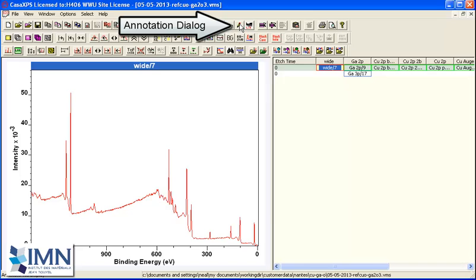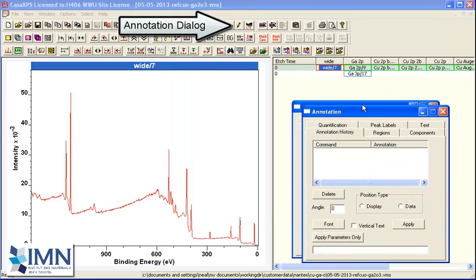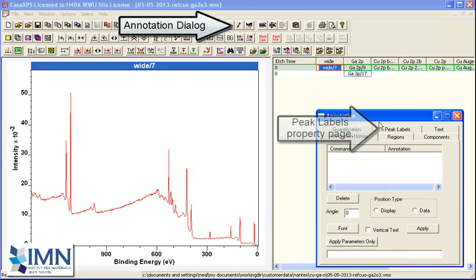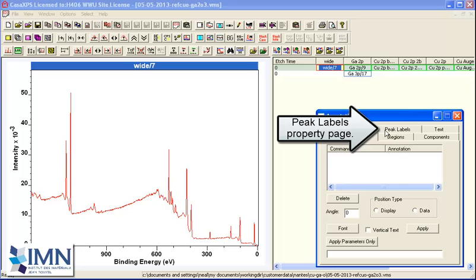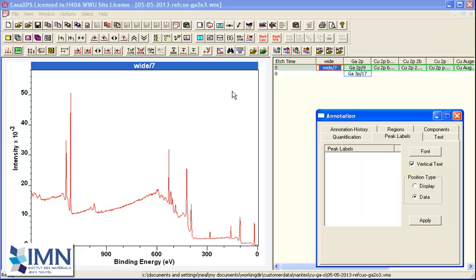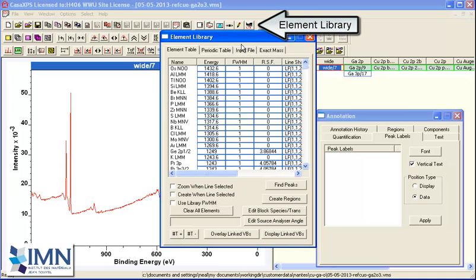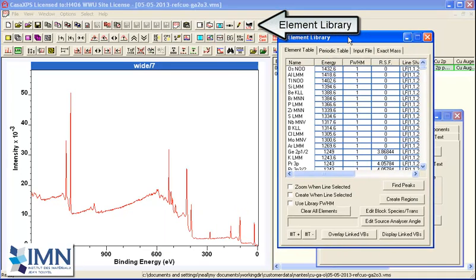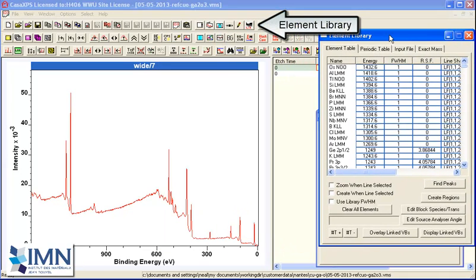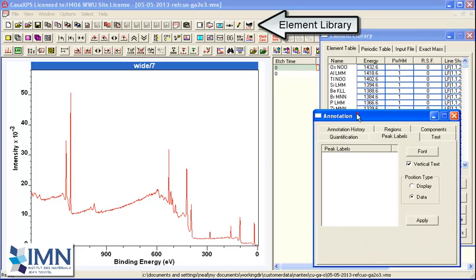Peak labels are added to the display using the annotation dialog window and selecting the peak labels property page. This property page works in conjunction with the element library. If I just place these so you can see the actions.